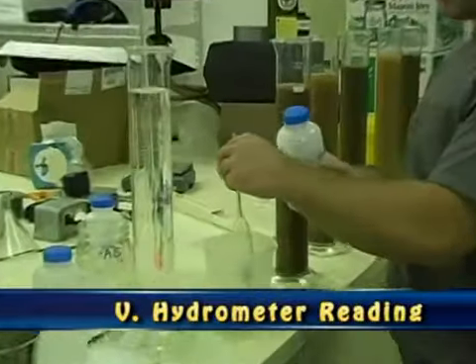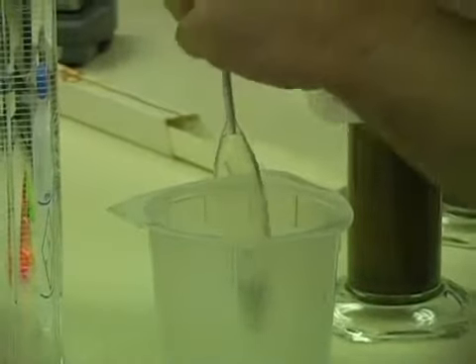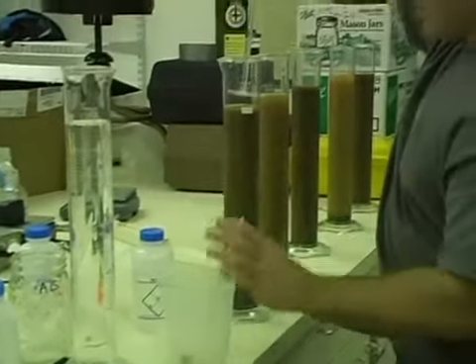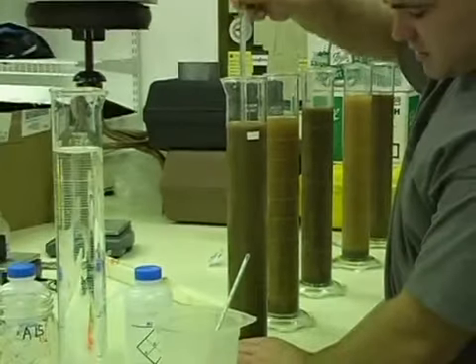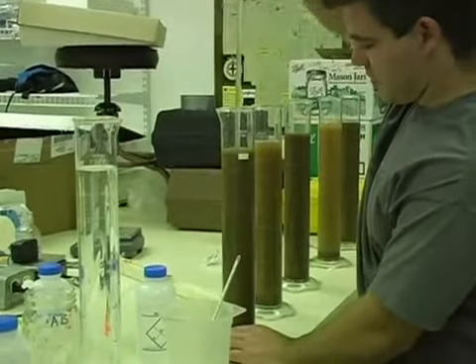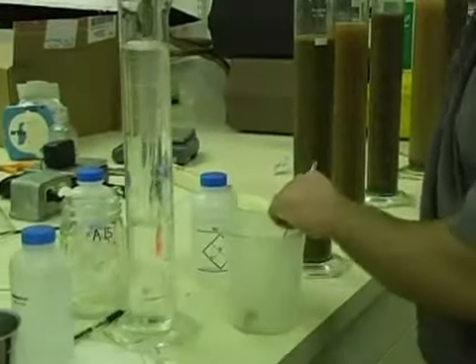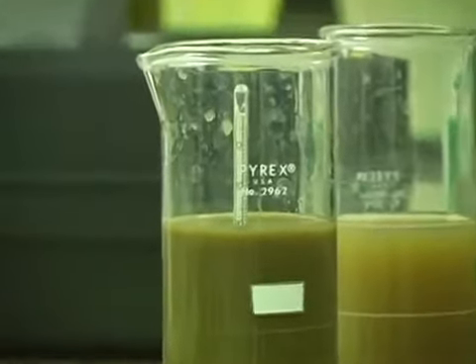It's important that in between each sample you rinse the hydrometer with some deionized water. And then we're going to begin the same process that we did with the blank. Going to mix the sample with the plunger. 6 hard swift strokes at the bottom, and then 6 all the way up and down through the column. As it comes out, start the stopwatch. You're going to wait and take a reading at 30 seconds.